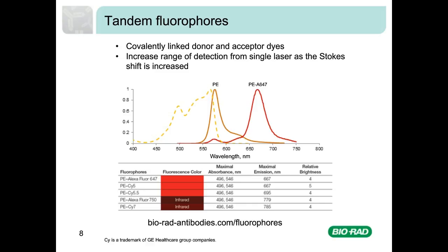Tandem fluorophores, however, may need special handling, as they can be sensitive to light and some fixation protocols.